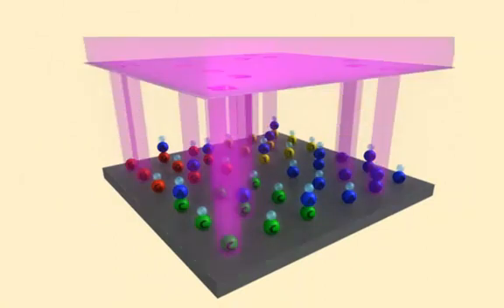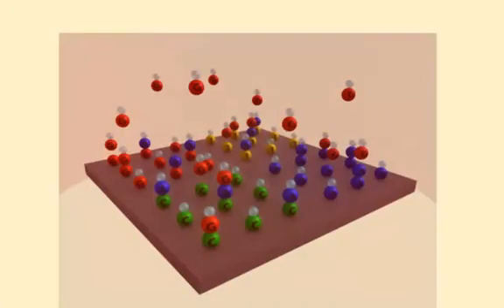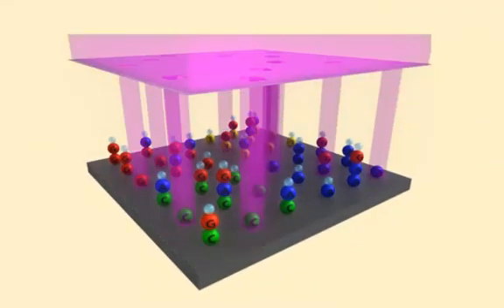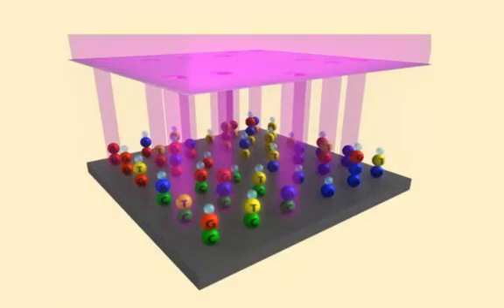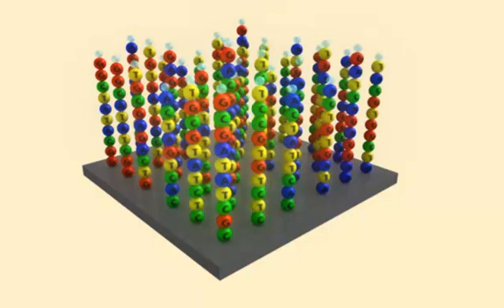Another mask and UV light de-protect specific features on the next layer. A solution of G bases is washed over the array, and the G bases attach to the de-protected features. The next mask and UV light de-protect features for the following layer. A solution of T bases is washed over the array, and the T bases attach to the de-protected areas. Then the next mask is applied, followed by a wash of C bases, which attach to the unprotected features. This process continues until you have an array with oligos of up to 25 nucleotide bases.